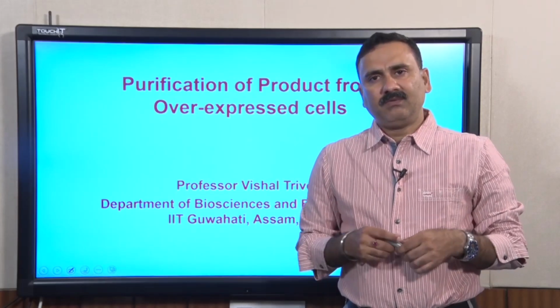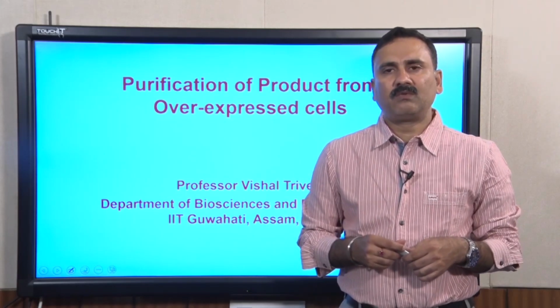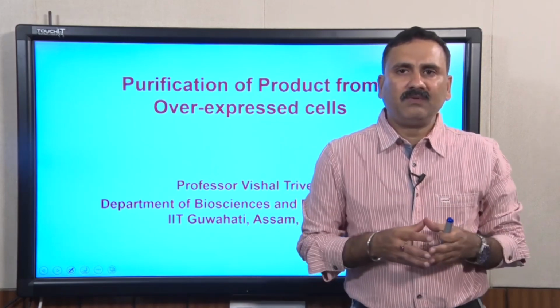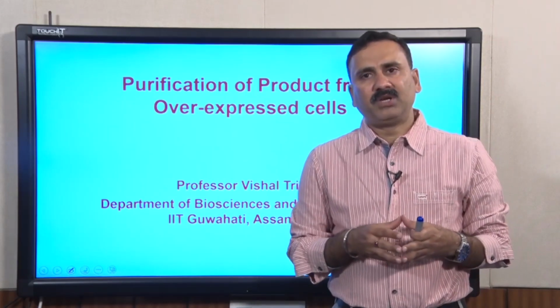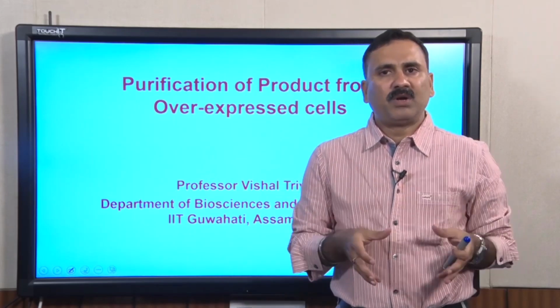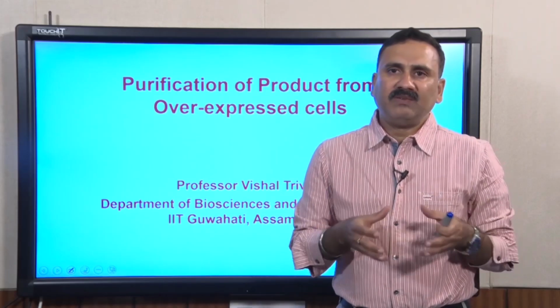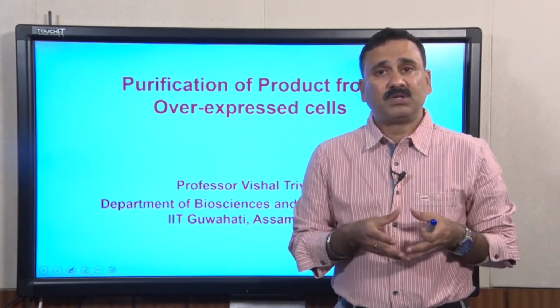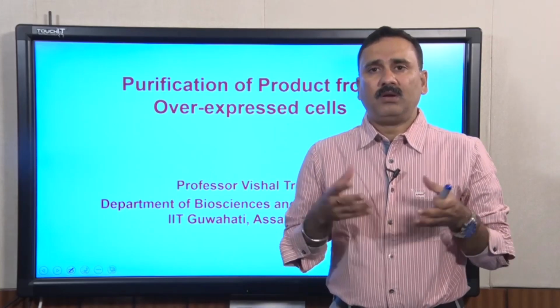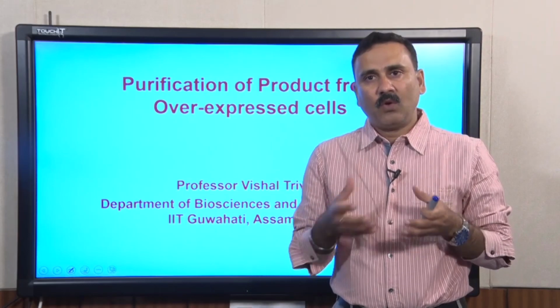And what we were discussing was the purification as well as the isolation of the product from the overexpressed cells. In this series, in the previous lecture, we discussed the basic principle of separation as well as the principle of column chromatography, and then subsequently we discussed the chromatography system and the different components of the chromatography system, their influence on the overall purification efficiency as well as the purification folds.